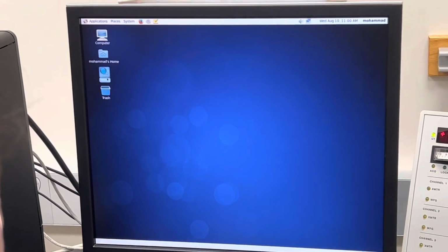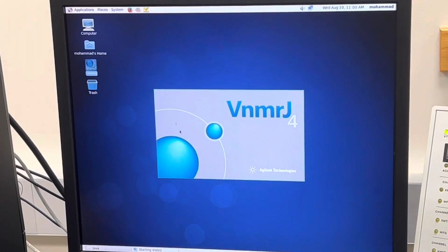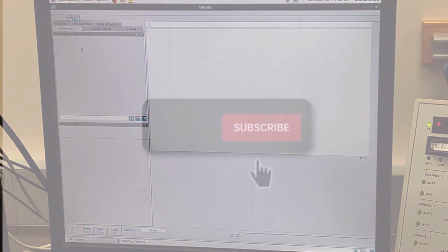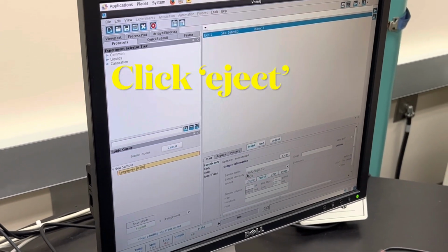Okay, now I'm starting. Start it. Now double click it. VNMRj. You have a handout with everything written here. You can study it, or not, it doesn't matter. Okay, check.